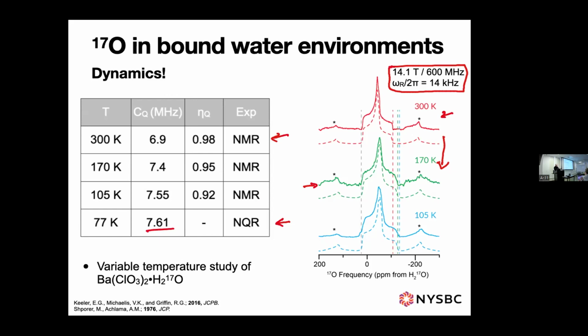It's also that at 170K, the density of nitrogen is changing pretty strongly, so spinning is difficult in Bruker DNP probes. Spinning gas, drive, bearing, and VT are all cooled, so you have issues maintaining a stable spinning frequency for long periods of time.